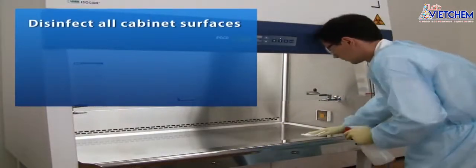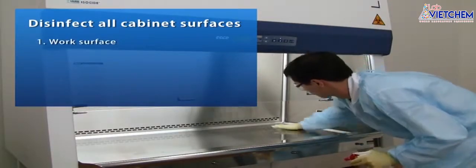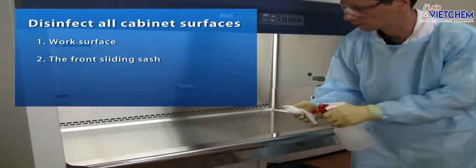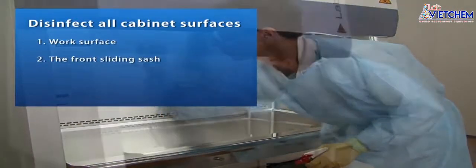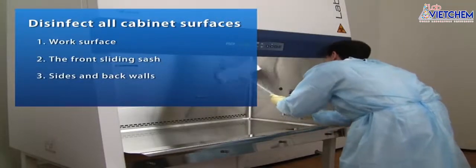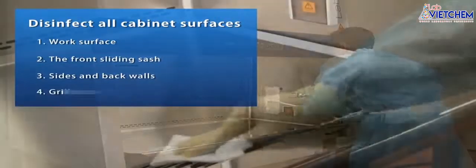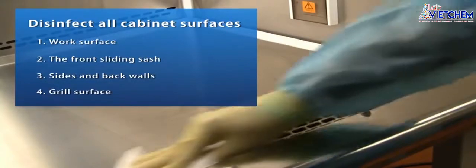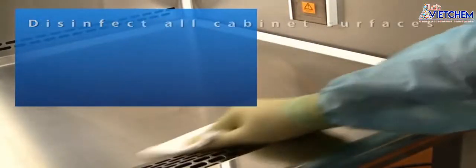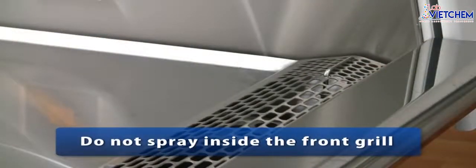With the sash window still in the safe position, disinfect all biosafety cabinet surfaces, including the work zone and front sliding sash, the work zone side and back walls, and the front grille. Do not spray inside the front grille, as only safety-trained operators should open and clean under the front grille periodically.